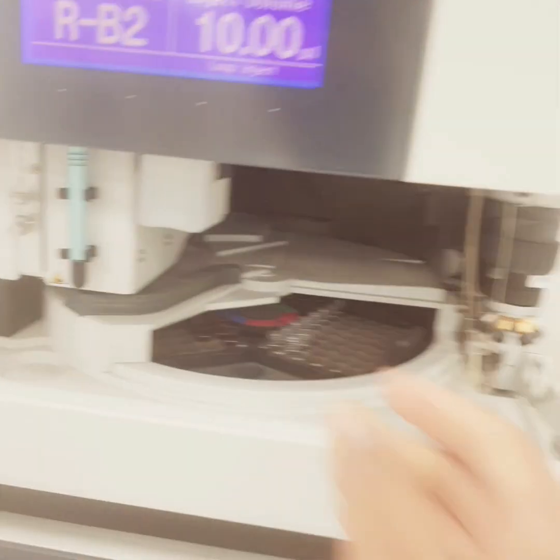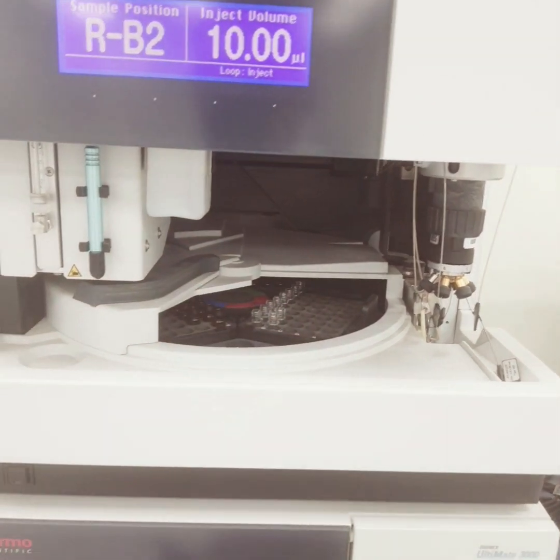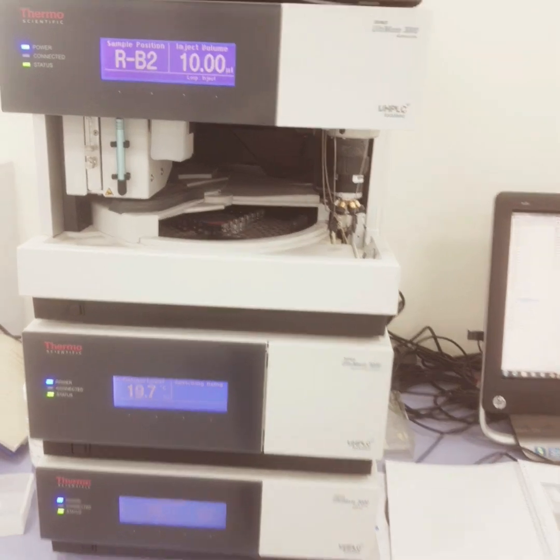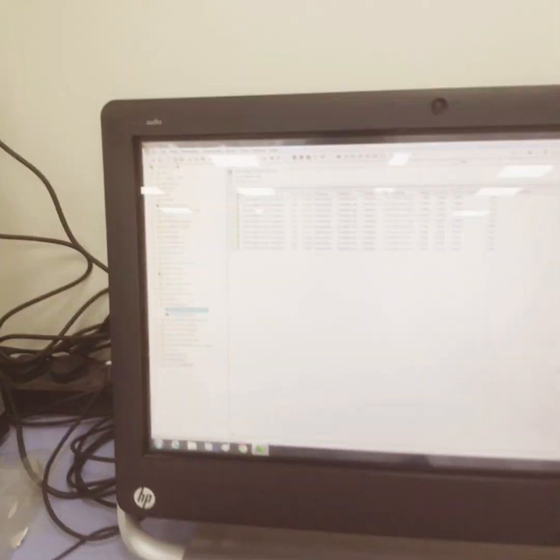And here also, basically to clean the syringes, we put the water. So usually the water that we use has to be very pure and has to be filtered using the 0.2 micron cellulose membrane filters, okay. So this point I forgot to tell you.